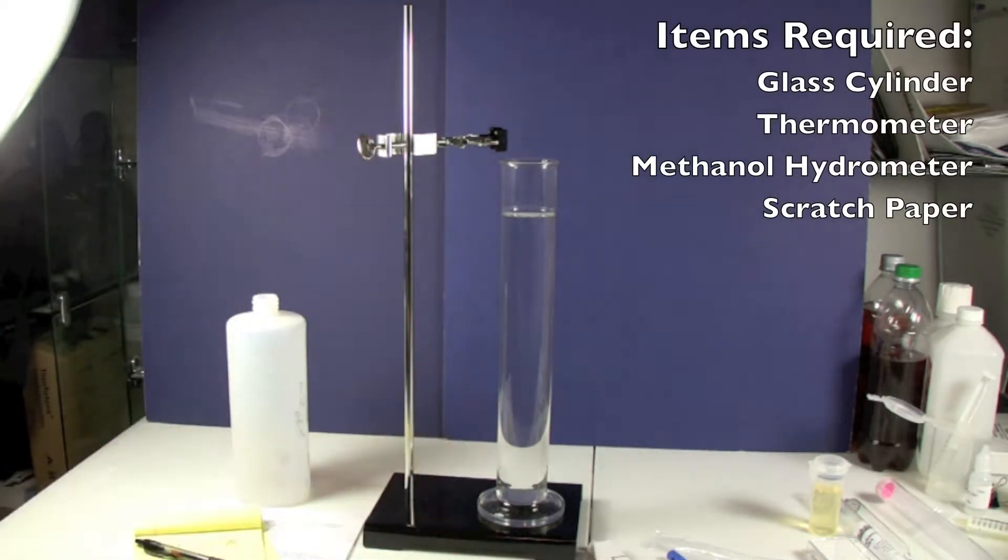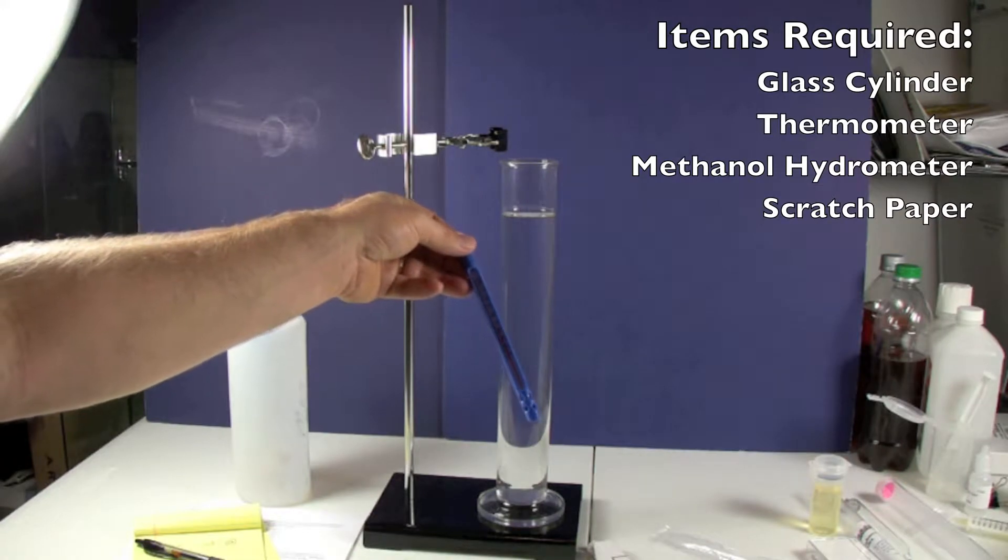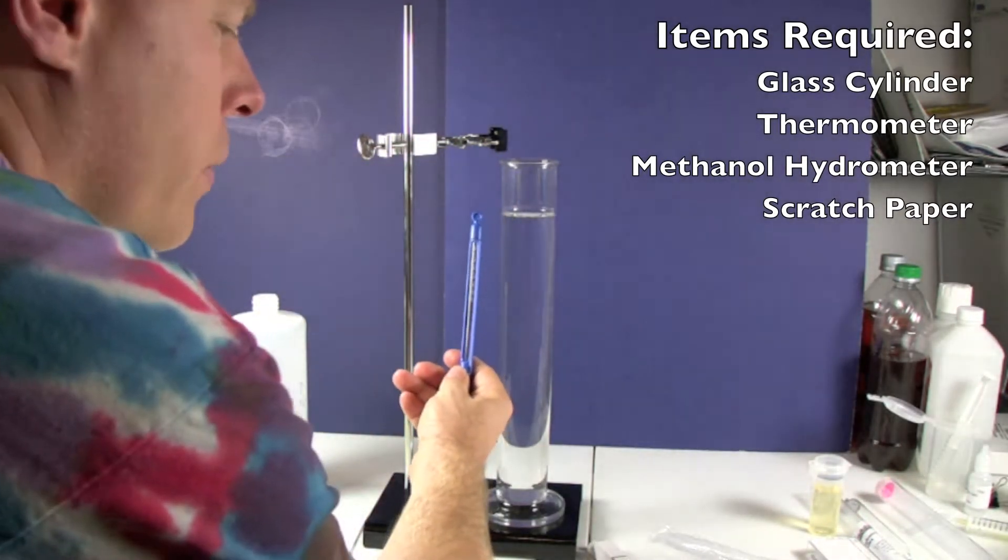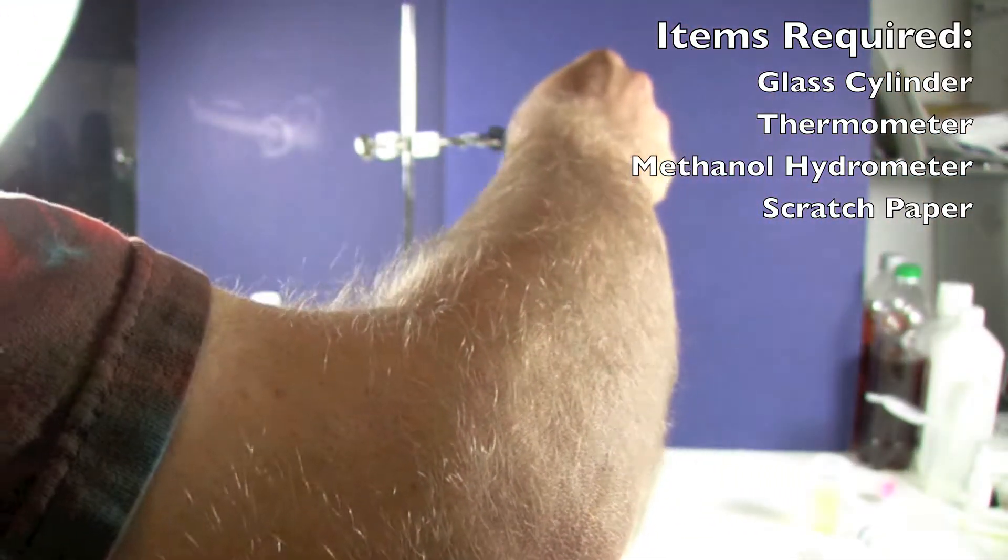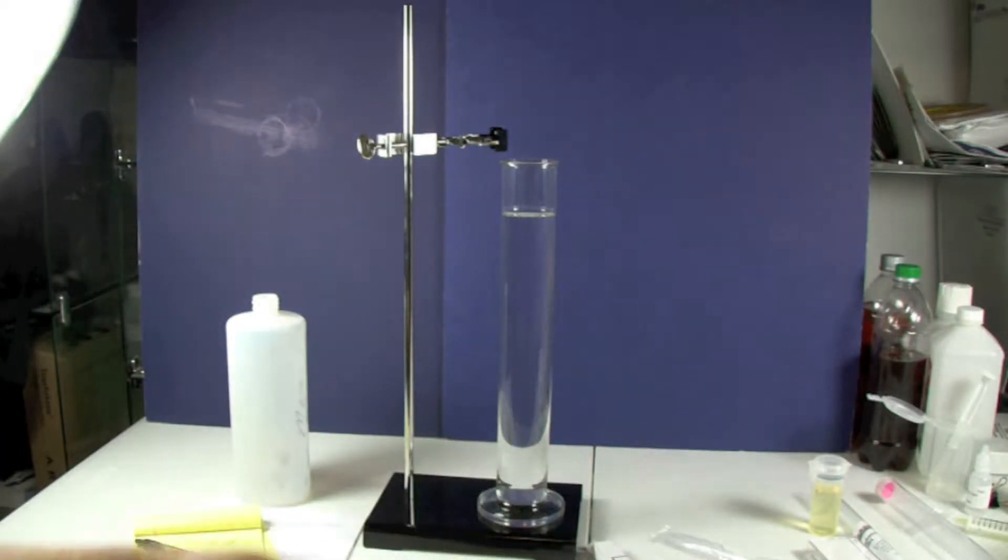To do this you'll need a cylinder to put some methanol in, a thermometer that's accurate down to one degree. You'll need a hydrometer specifically for measuring methanol which this one is. Then we've got this handy stand that allows us to put a thermometer in here and measure this.